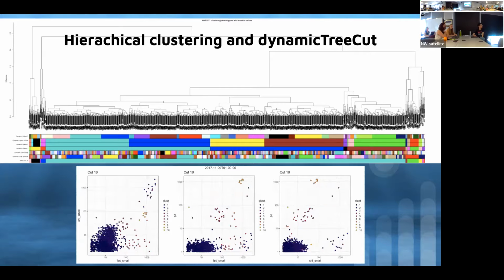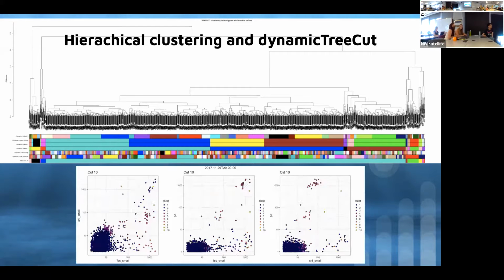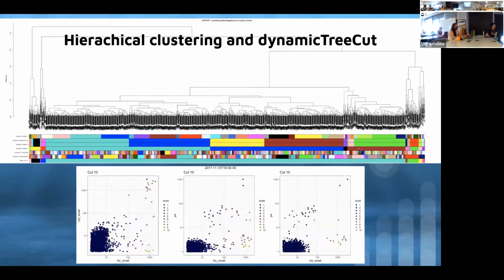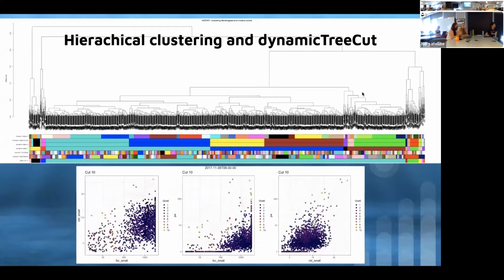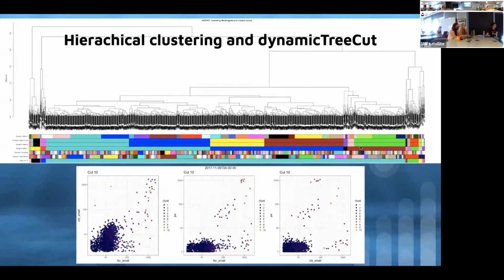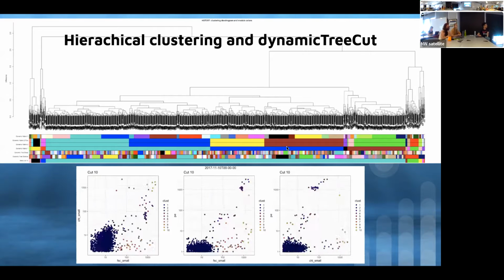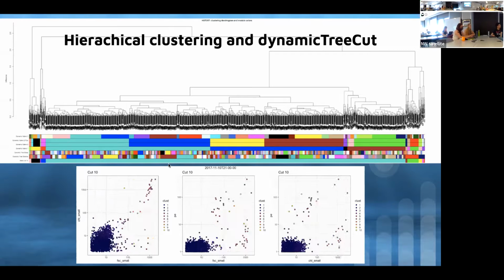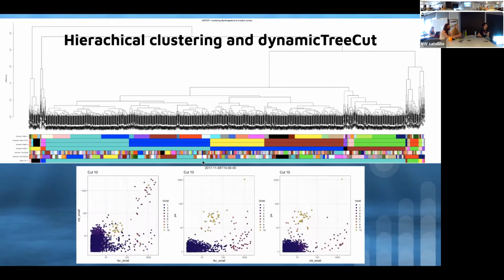Charlene and I looked at hierarchical clustering, and then doing more creative and deeper cutting using dynamic tree cut. This dendrogram is drawn from every single particle in 1 hour, and clustered using distances that we calculated. These color bars that you see are a variety of different algorithms or parameters within dynamic tree cut, which is a package in R. The bottom one is if I just cut straight across to get 10 branches.